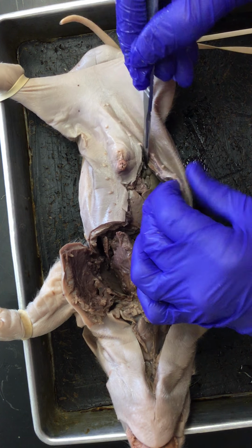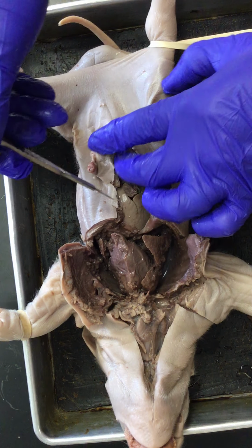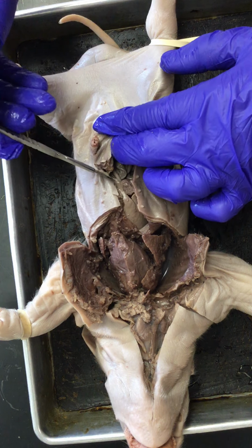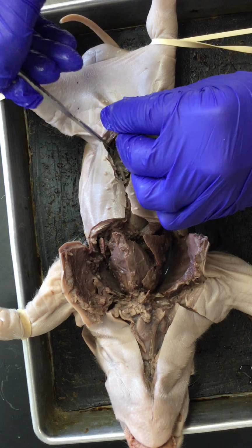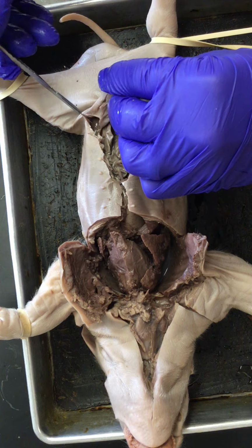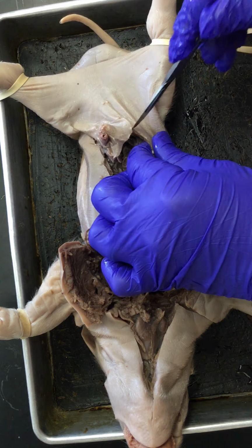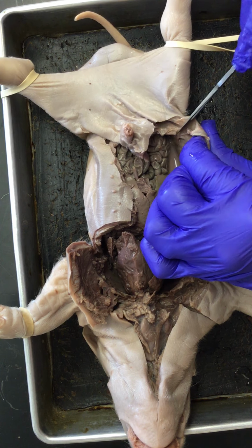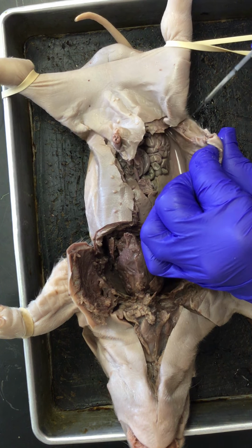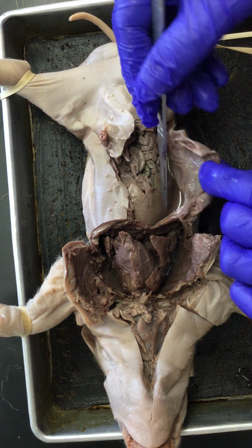All right, so I'm going to cut around the umbilical cord to expose the abdominal cavity. And I'm just going to cut along the side here. So again, just cutting through skin, connective tissue.